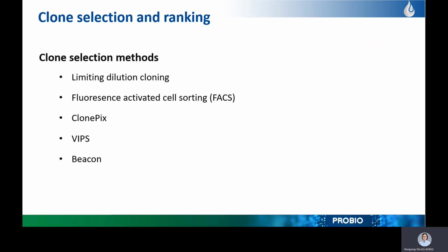After talking about host cells and vectors, let's talk about screening techniques. Here are several common screening methods, including manual operation and equipment use. They are limiting dilution method, FACS, ClonePix, VIPS, and the Beacon platform.